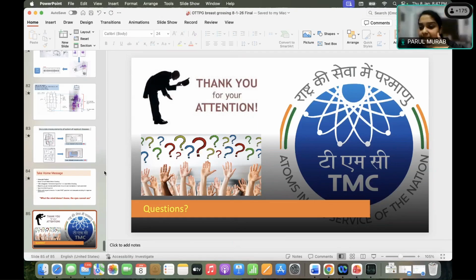Okay, ma'am, next says Ackerman book says to cut from the anterior side. Which one is better? So actually in our country, we generally go through the posterior aspect, because as a standardized format, most places follow one single slice through the posterior aspect, which is generally fascia covered and easier to identify. I have not seen the skin cut used in any of the major centers in India. I know that Ackerman uses that, but in India generally it is one cut, and it is easier for the surgeon also to give one single cut.